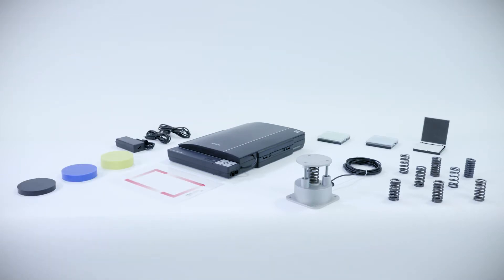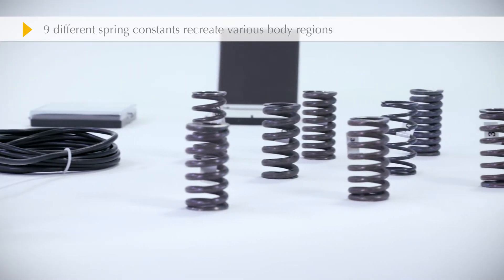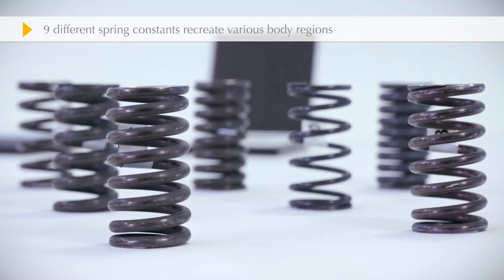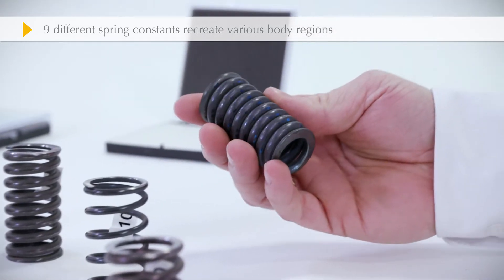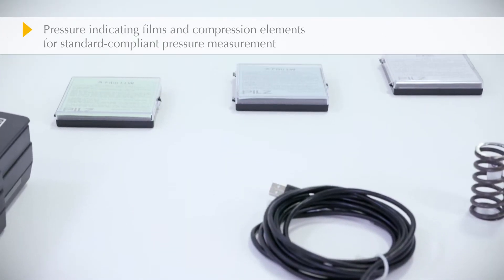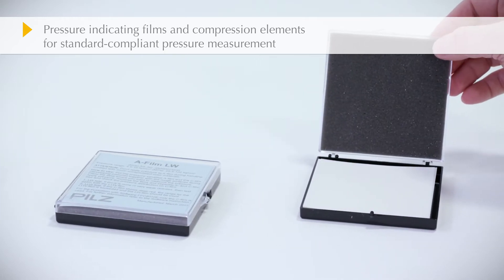The force measurement device is equipped with springs and sensors and records any forces exerted on the human. Nine springs with different spring constants are used to recreate the various body regions. Pressure indicating films are used to measure the pressure, which is then compared with the specified thresholds.